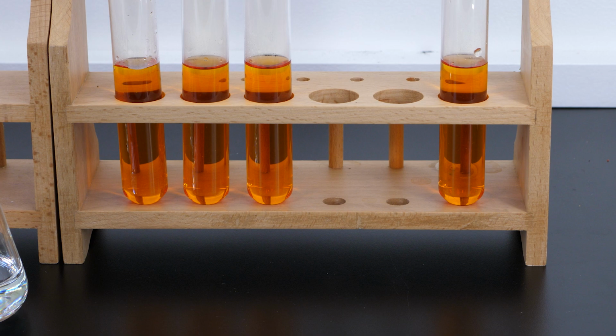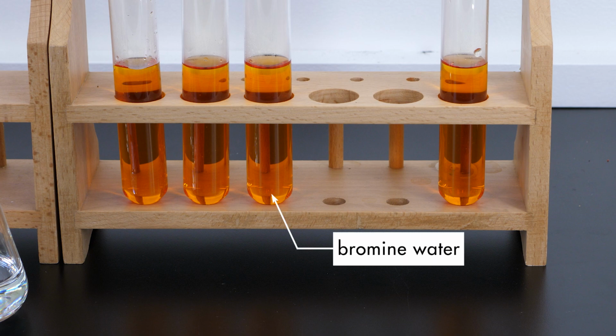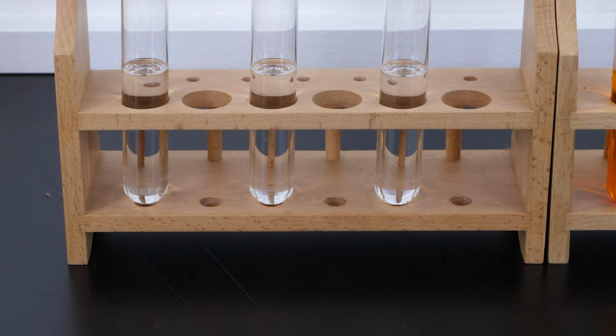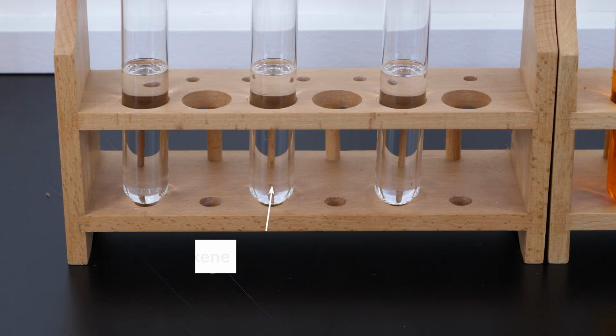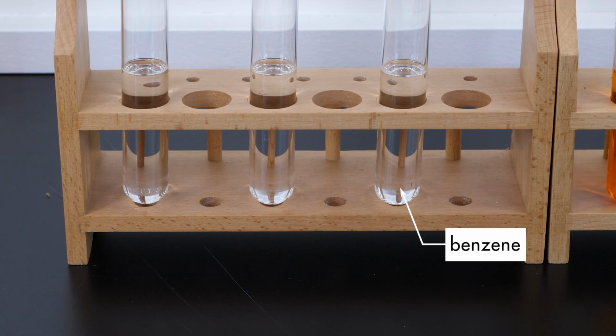If bromine water is added to an unsaturated hydrocarbon, the hydrocarbon will react with the bromine to form a colorless compound. For this experiment, we have test tubes containing bromine water, a test tube containing cyclohexane, a test tube containing cyclohexene, and a test tube containing benzene.